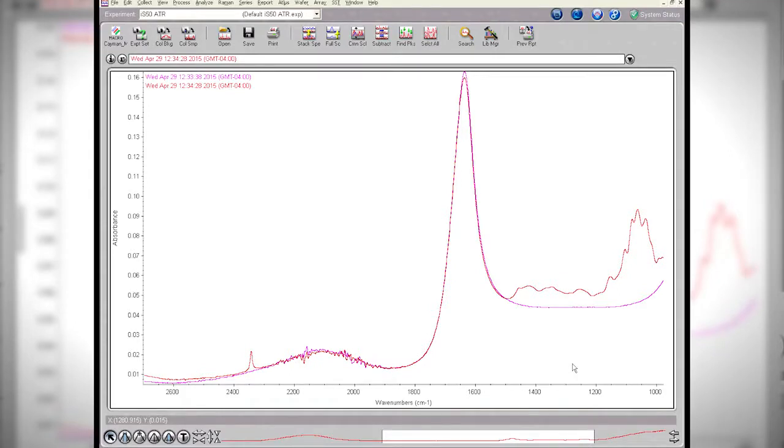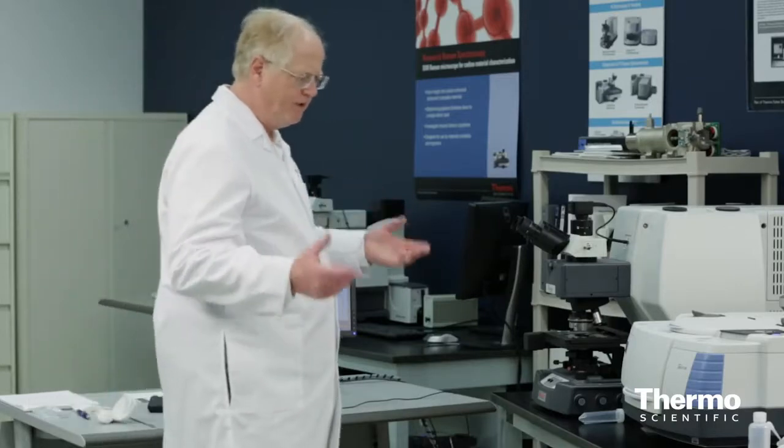And this sharp little peak right here is due to the dissolved carbon dioxide, the carbonic acid, or CO2, that's in there, H2CO3, that's in the solution. So you get this small little peak here. So very briefly and very quickly, that's why ATR is such a popular technique. It's so easy to use. I have run in the span of this video not only multiple different samples, but different kinds of samples. A solid piece of plastic, powder, liquids, run them all, no problem.